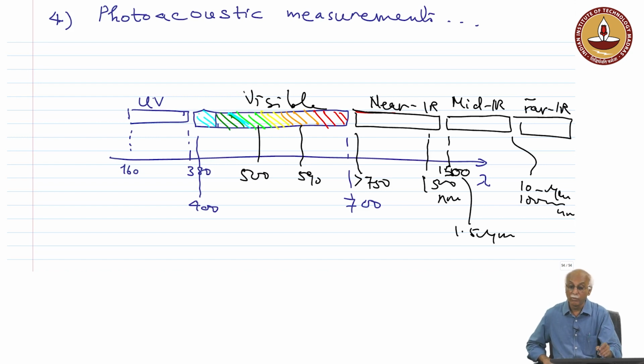So, this electromagnetic wave part of the spectrum interacts with various molecules, atoms, etc. And if we consider only the electrical field of that electromagnetic wave, what will happen when it interacts with atoms and molecules? The electrons in those atomic and molecular structures will start vibrating. In the case of a molecular structure, even the atoms which are bound and forming a molecule will also start vibrating.